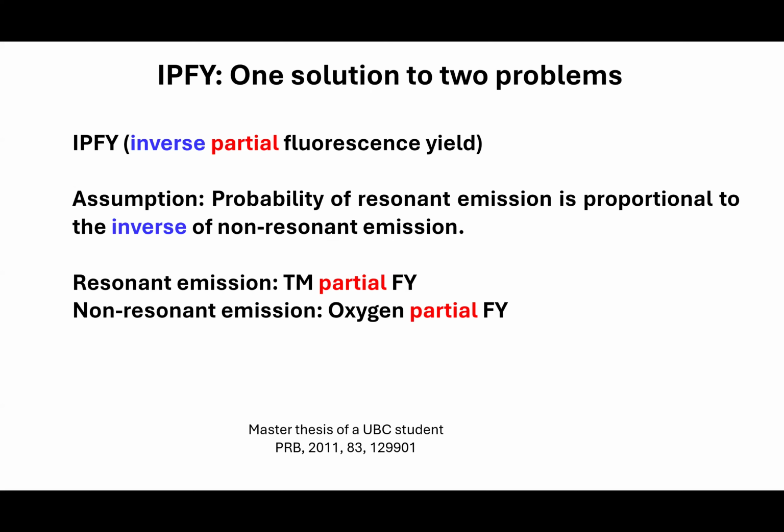For people who have measured many samples at XAS, you probably have already used this mode, and it was explained by Adrian in his email, giving instructions on which channel corresponds to that. You probably also realize that you do not always have to use IPFY. Sometimes your TFY is also pretty good, and sometimes your PFY is also pretty good.